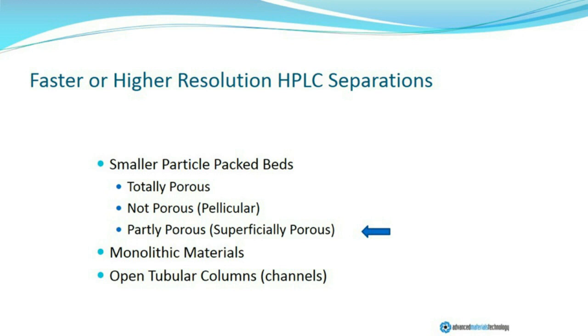What I'd like to share today is some additional or new alternatives for separations of proteins and peptides. The discussion today will really focus more on methods of use than materials, but it's necessary to discuss some of the materials that have been used during the past several decades for HPLC separations.